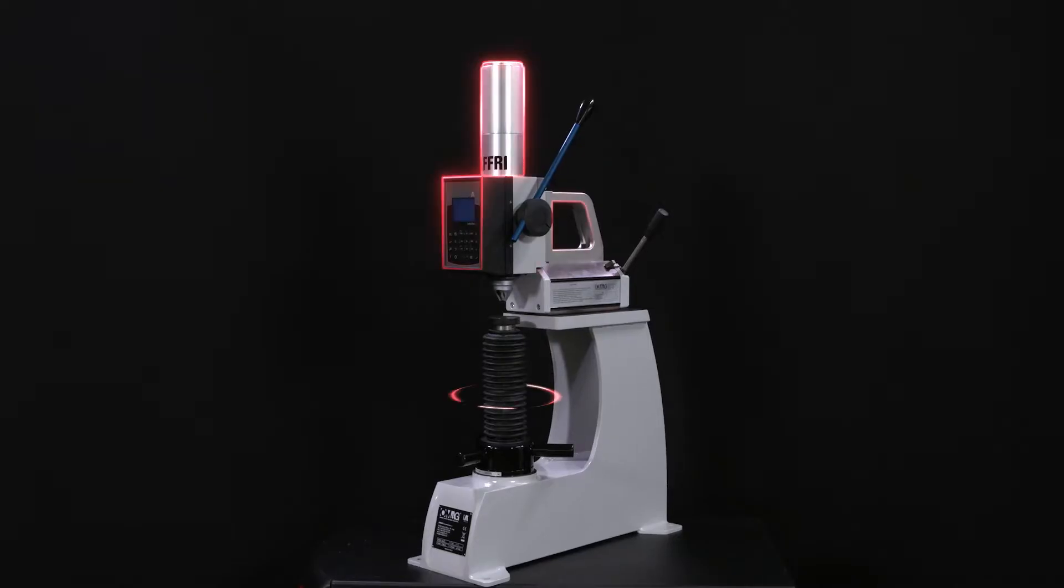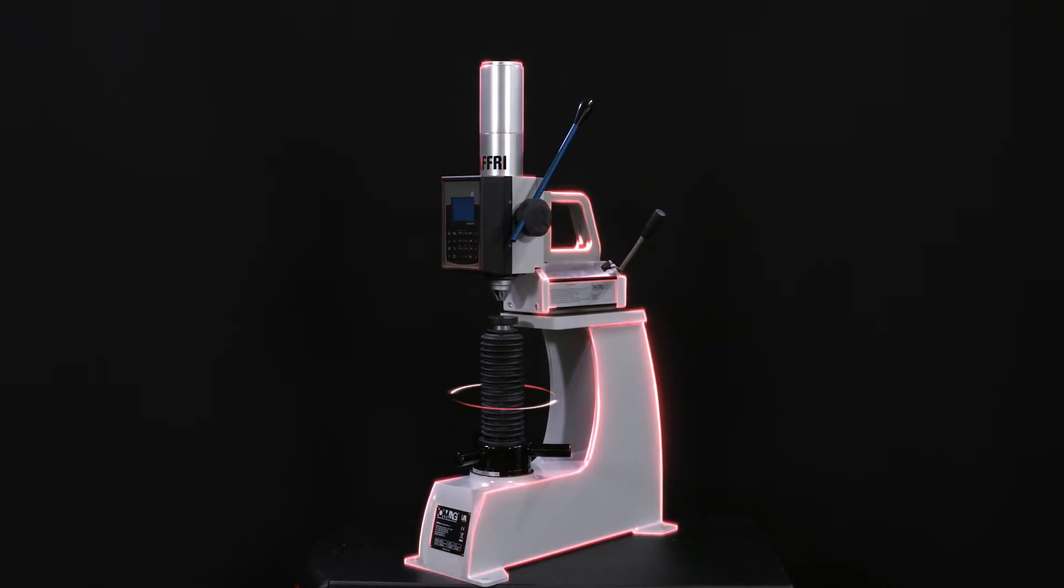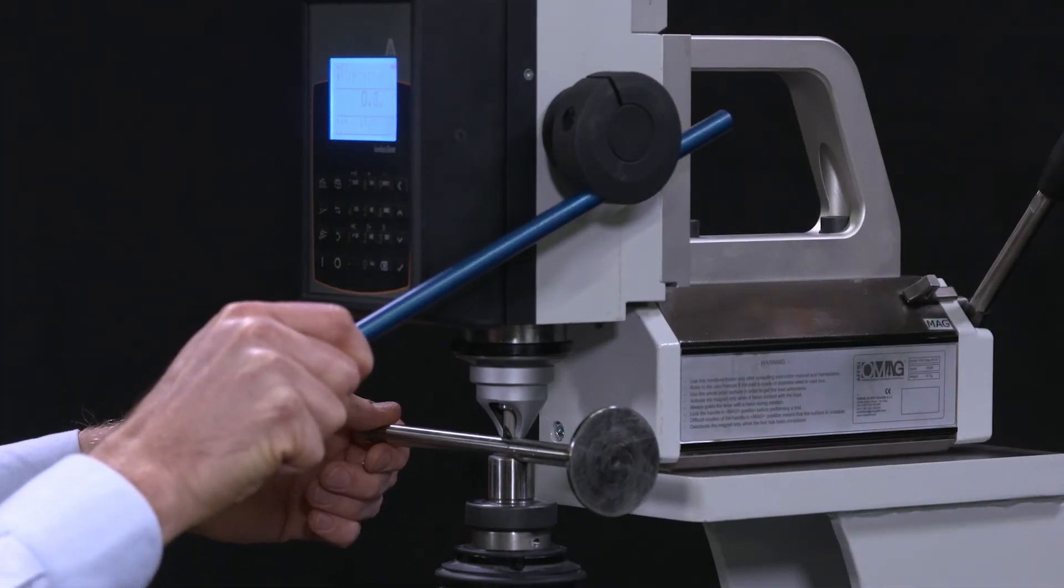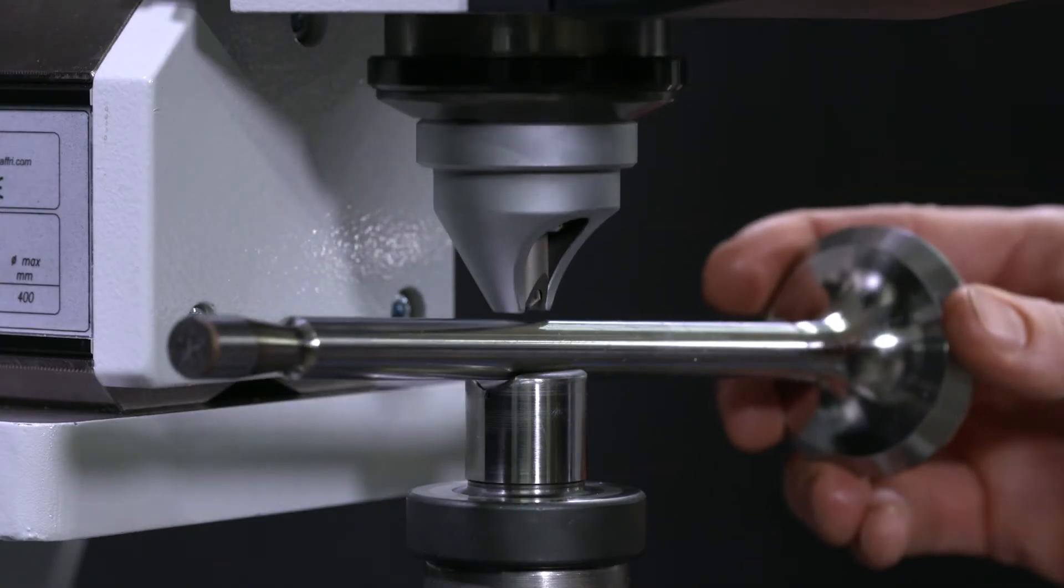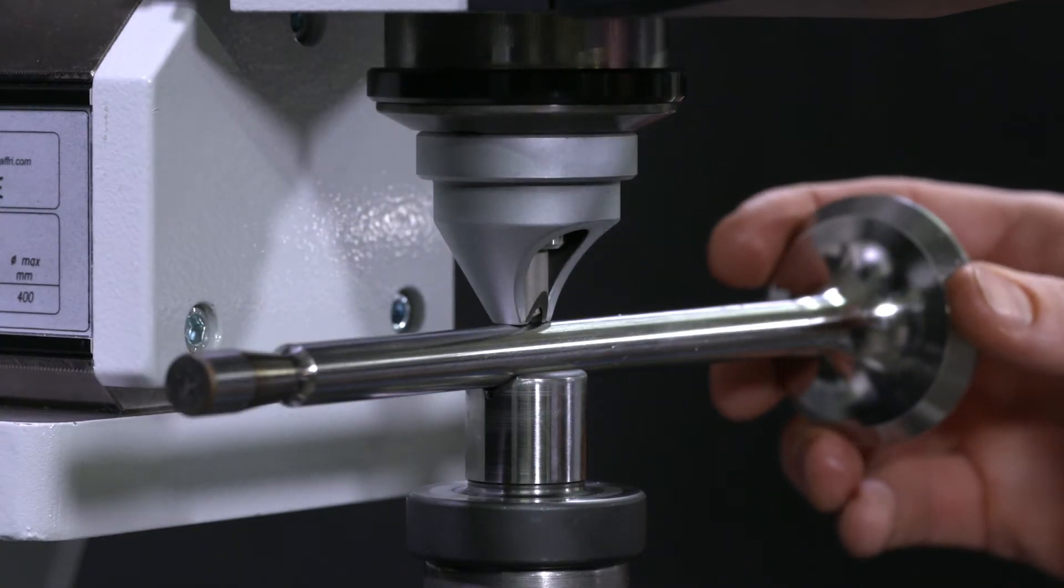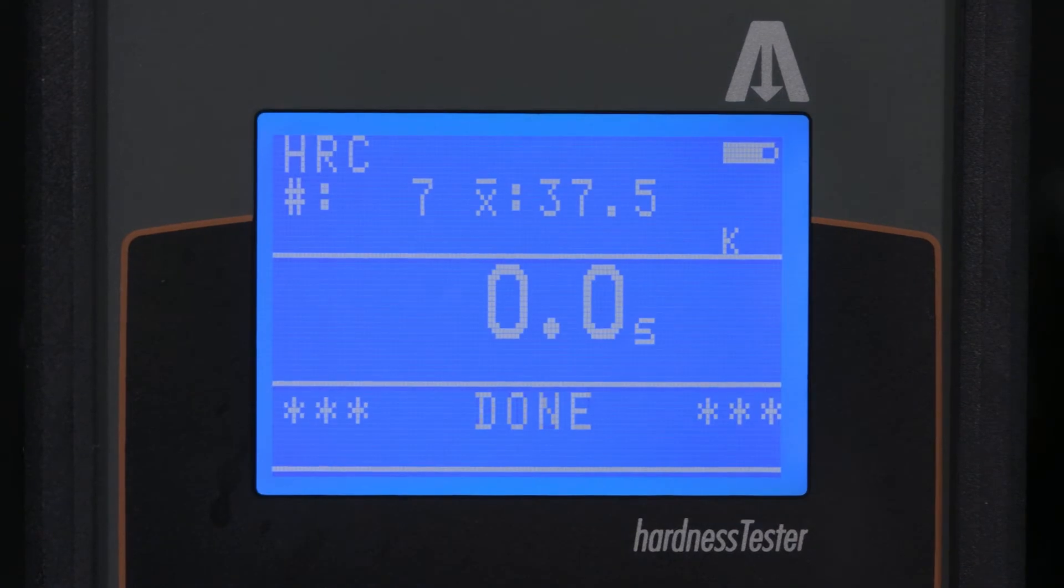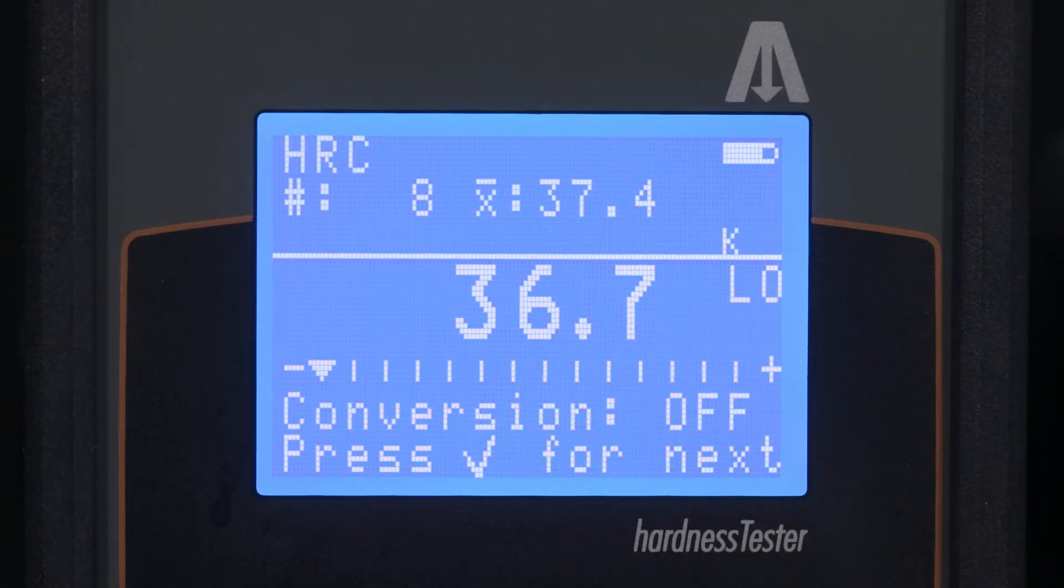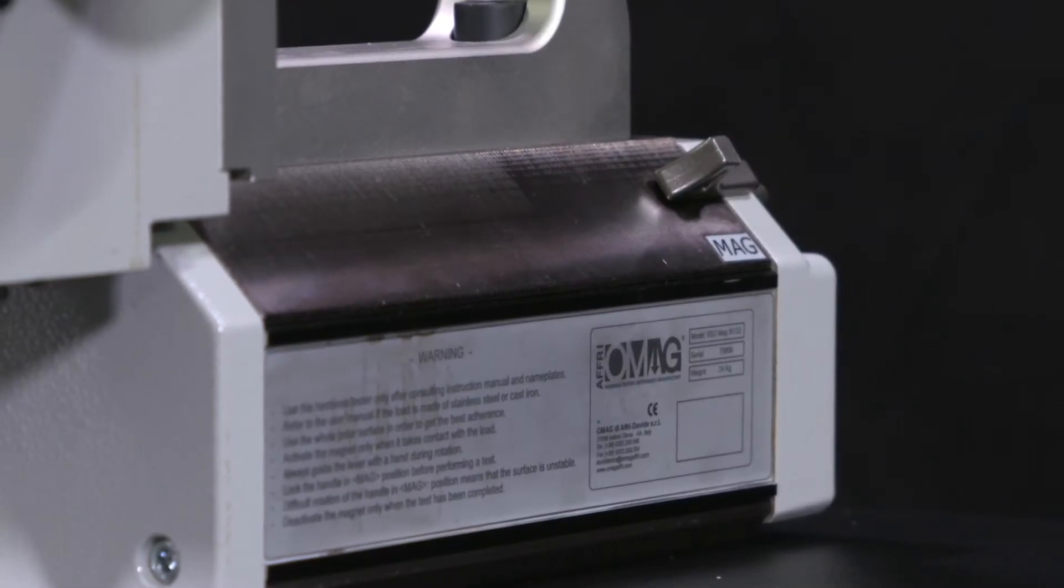If used with a dedicated stand, the RSD-MAG can be converted into a regular benchtop hardness tester. This system complies with hardness testing standards and can be used in the laboratory on small pieces and prepared samples.